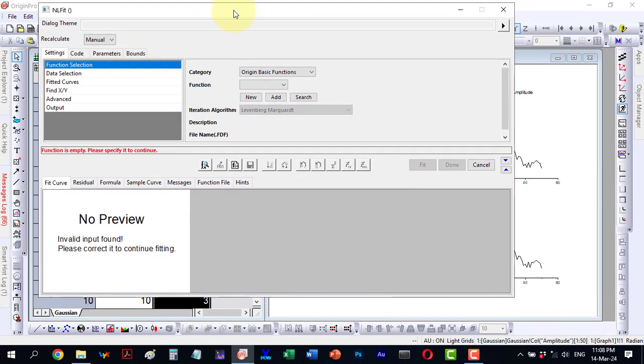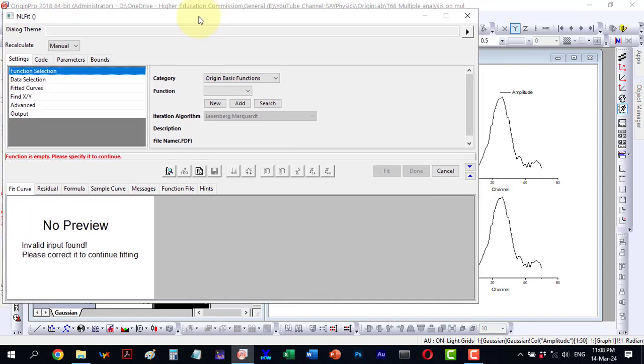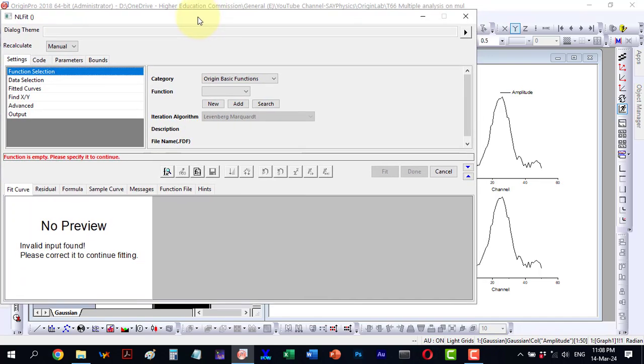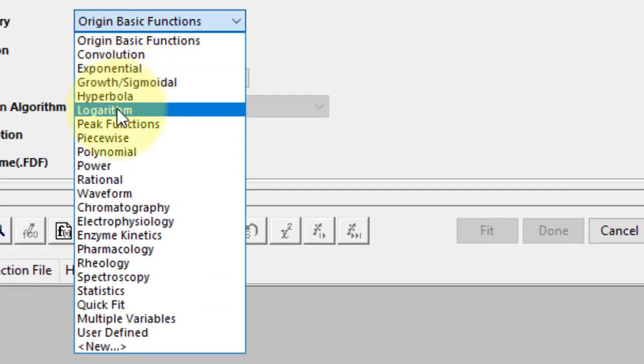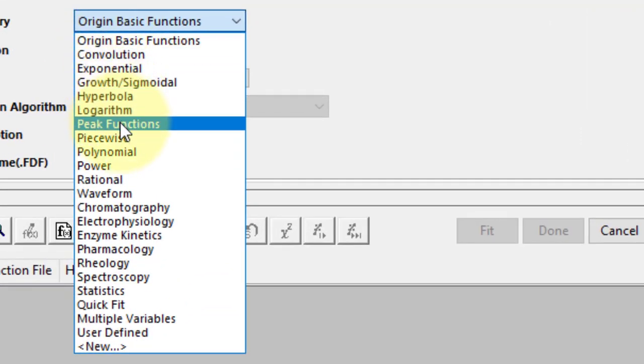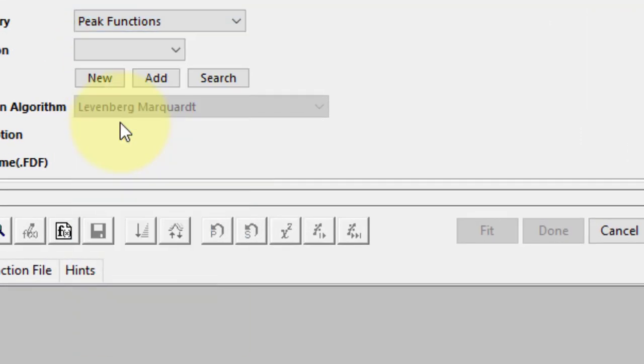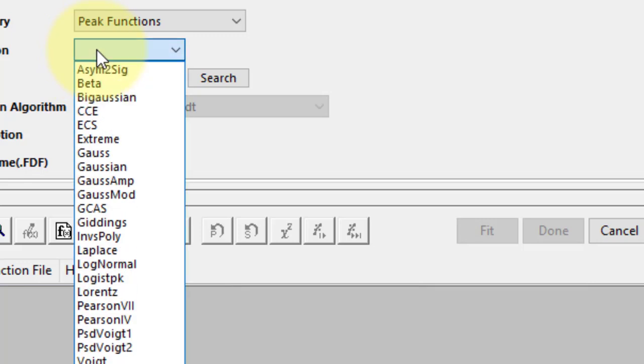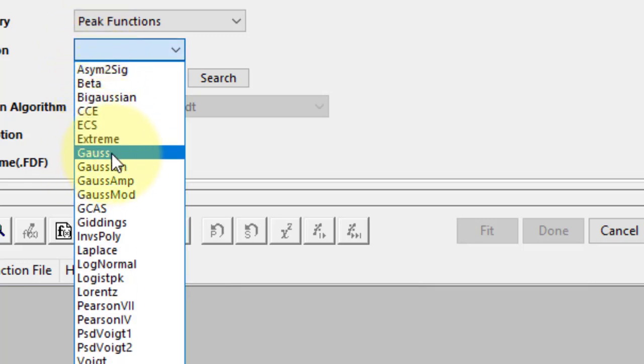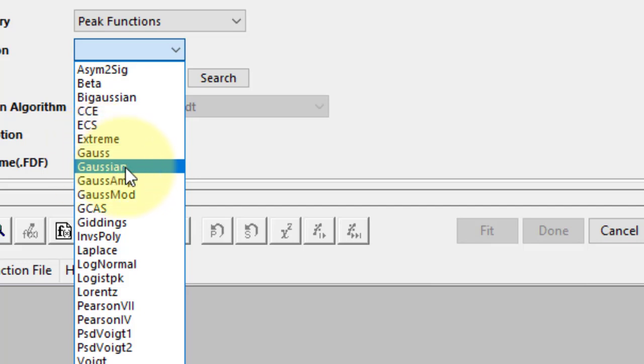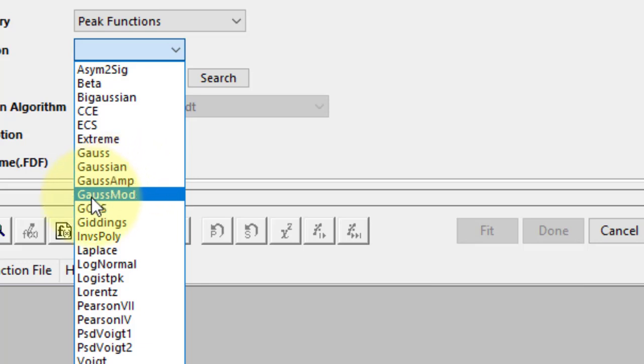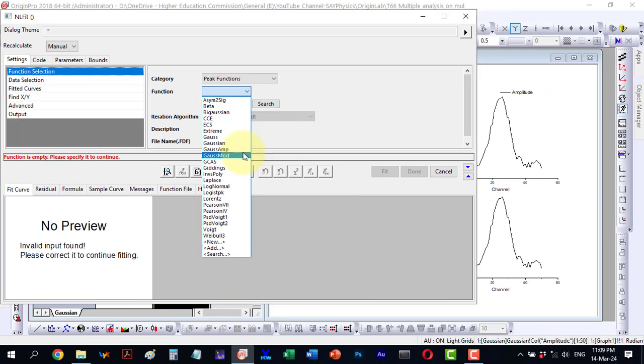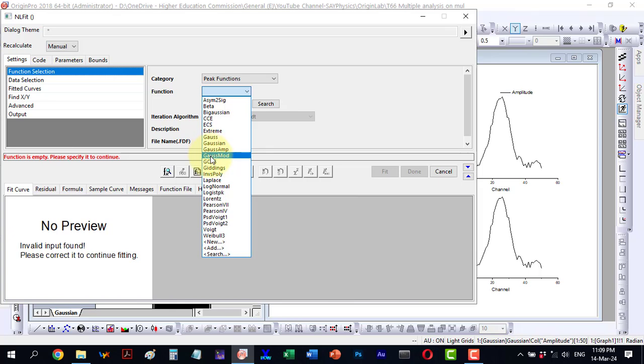Upon opening the dialog, I can choose from various functions. Let's explore under the origin functions. I move toward peak functions. Within peak functions, I find Gauss, Gaussian, Gauss-Amp for amplitude and Gauss-Mod functions. We will proceed with each of these functions here. As we have four panels, each will be associated with one function. We will conduct the fitting and examine the differences among these functions.